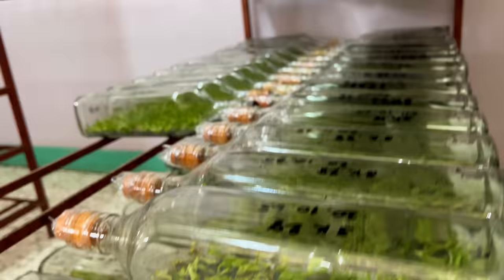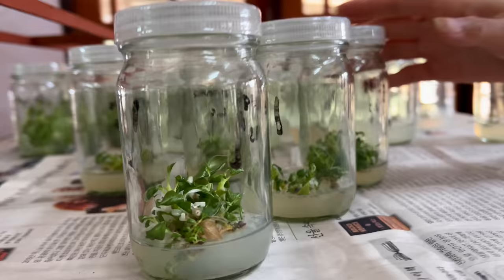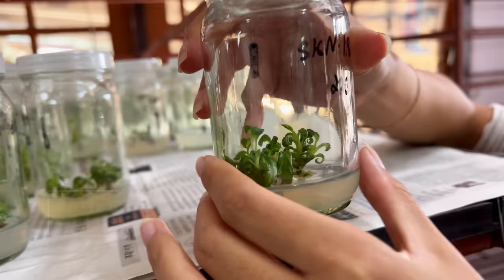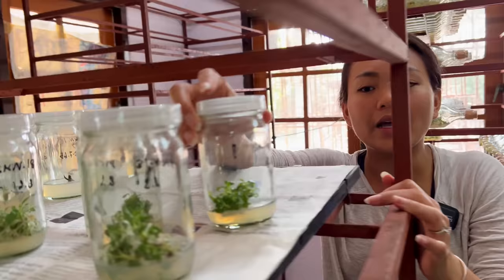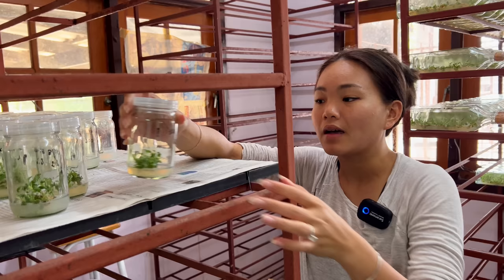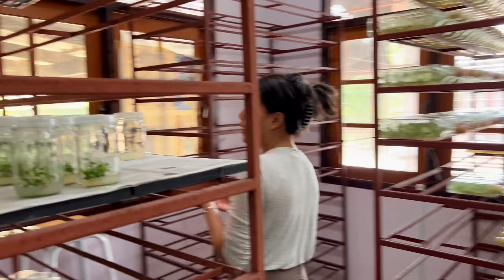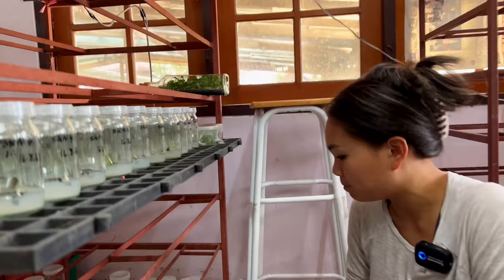You can see these are growing — you can see the leaves now, and some variegation in here. This I think is another White Princess. So you can see the leaf is variegated. With good ethics, when a customer says they want ten White Princess in a bottle, I come in and if I see some greens, I'd ask employees to take them out and only keep the white ones. When these were the big hits, people would buy one and it'd be too variegated and the rest would be green. We try to keep good business ethics.